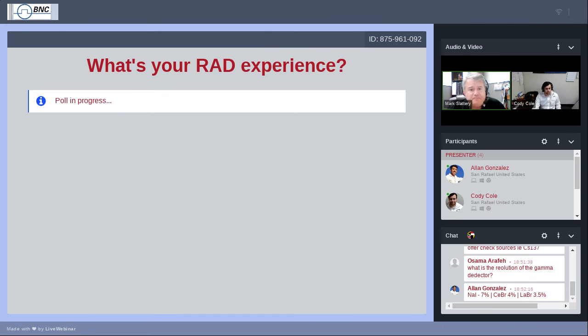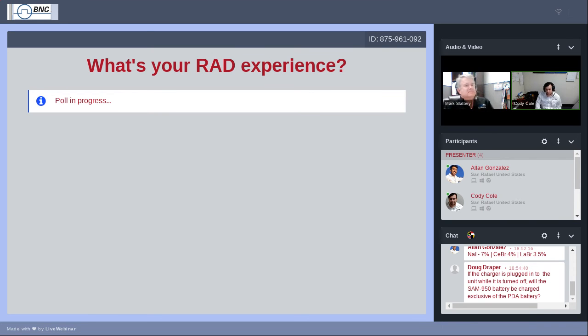All right, so it looks like in terms of the polling, a lot of people here have experience with isotope identification equipment, which does make sense. We did create this virtual training with the appeal for both people who are new to this equipment, new to the SAM 950, but it's also for experienced users or those who are looking for a refresher. So I am glad to see that a couple of people are not quite in it yet or are going to be in it very soon.